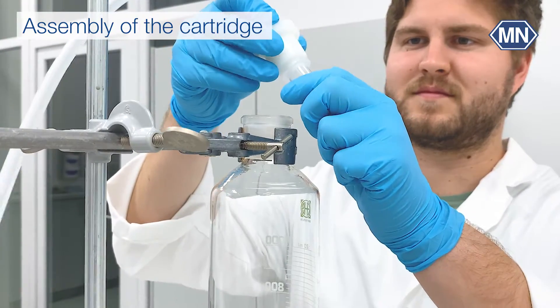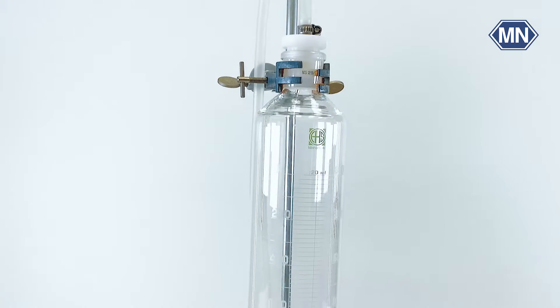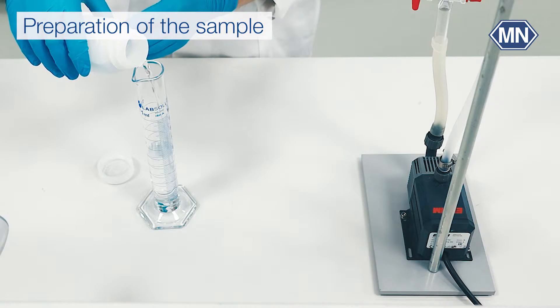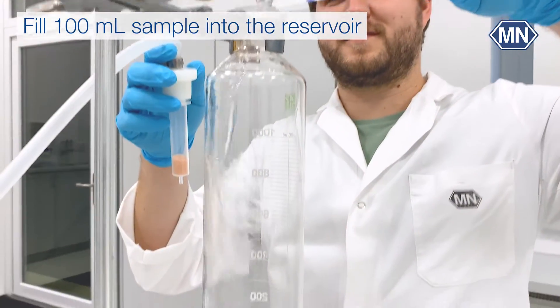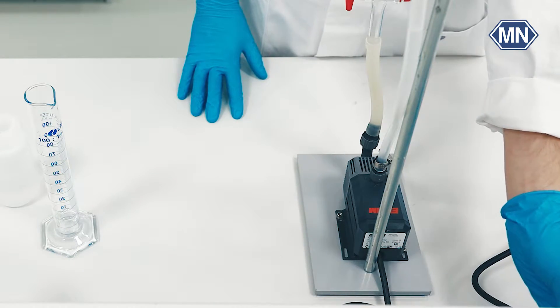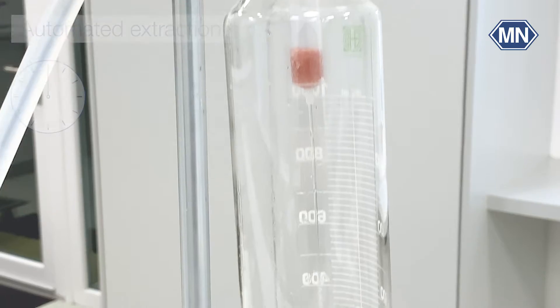Connect the nanosorb cartridge to the adapter. As soon as you plug in the power supply, the pump runs and the extraction starts. Let the extraction run for 20 minutes.